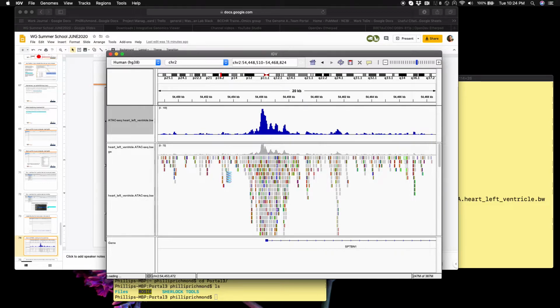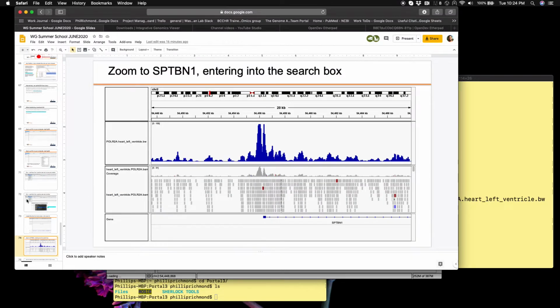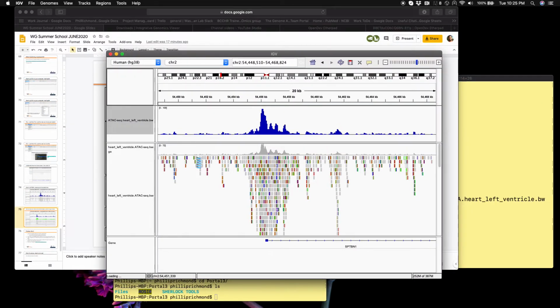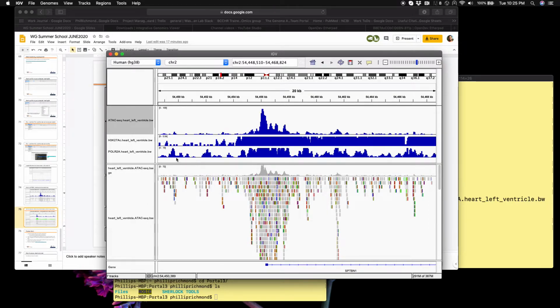It's going to take a moment to load. Double check on that in a minute. See if there was anything else included that I'm missing. Nope, that looks like about it. Now it's started to appear. There we go. So, we now have 3 bigwig files.